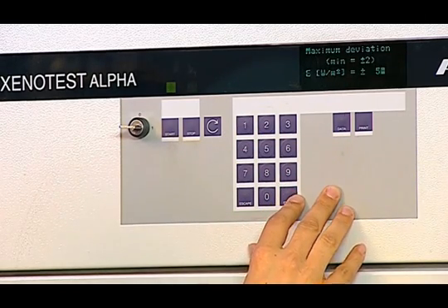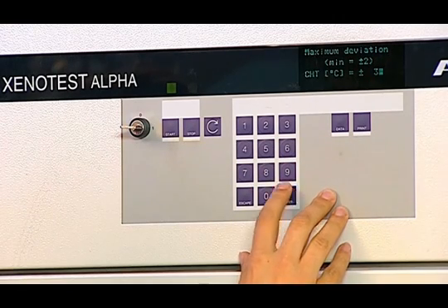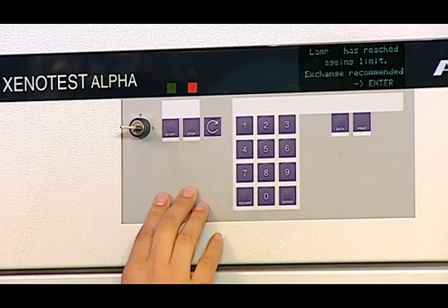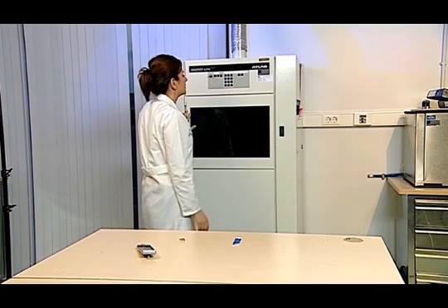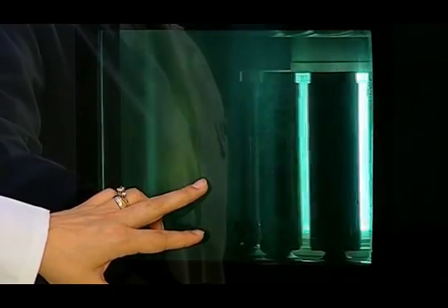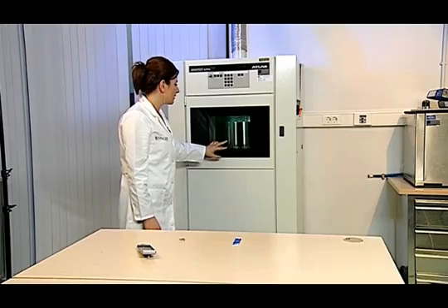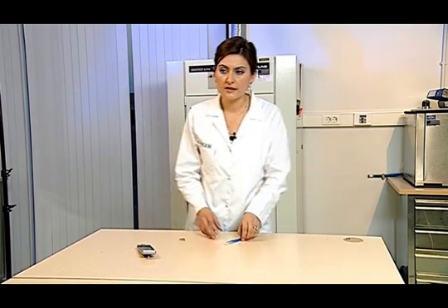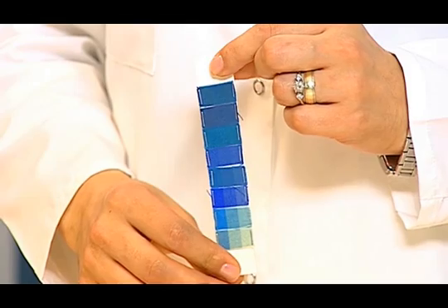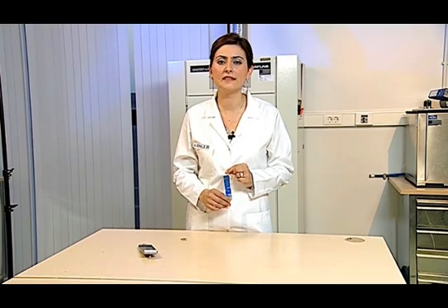The tolerance of the entered values is checked by pressing the enter button. If there are no errors, the device is started by pressing the start button. The test device works in rotating mode and applies the same amount of light on the samples in the front and the back. When exposing samples to the fading process, the blue scale reference sample is covered with a mask. The test is ended when a fading equal to grade 4 according to the grayscale appears on the sixth blue woollen reference. The sample is then removed and the blue color change is evaluated by comparing it with the scale.